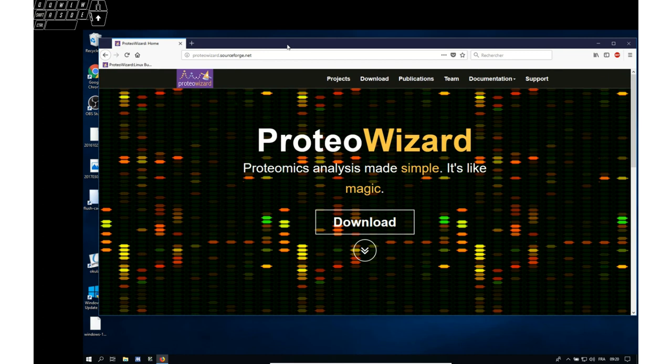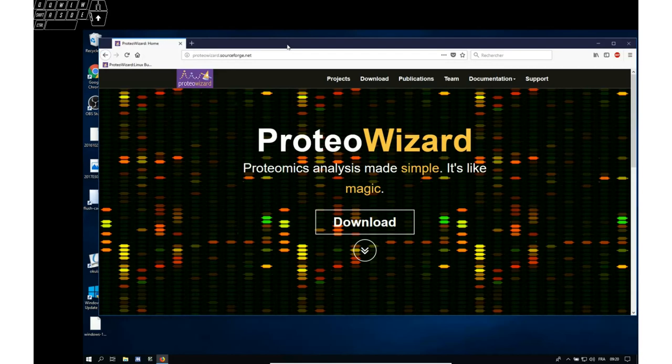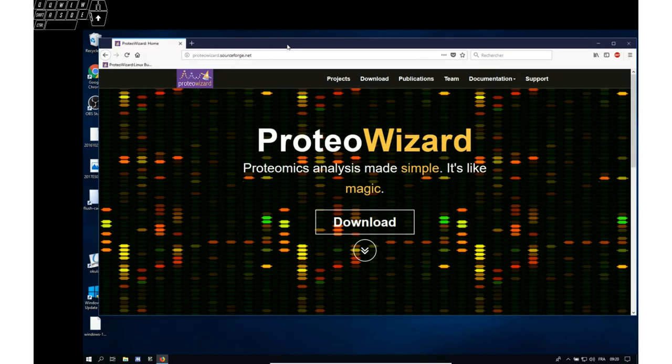To get to use the MSConvert software that is useful to convert raw mass spectrometry data files to the open standard data format called mzml.